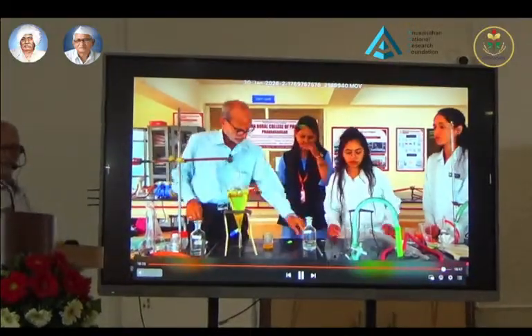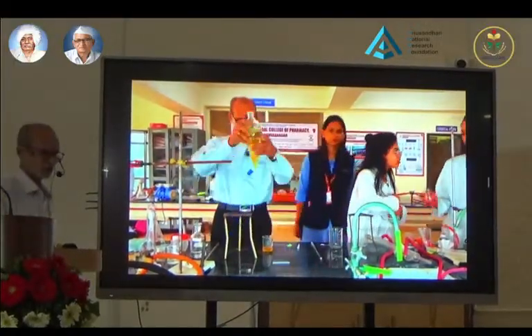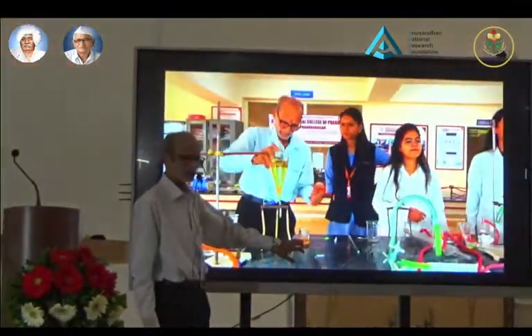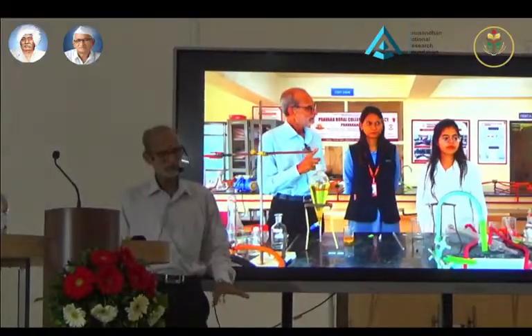Normally acid does not pose much problem, but if you use a base, then you will get a lot of problems because it forms an emulsion. Now this is the sulfuric acid layer in which quinine is present in the form of the sulfate.